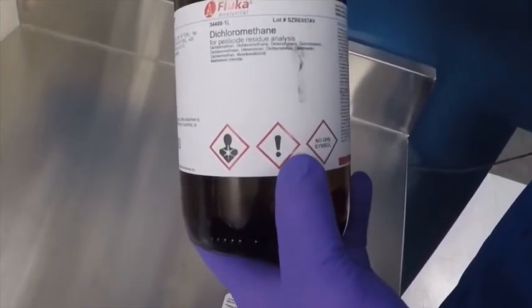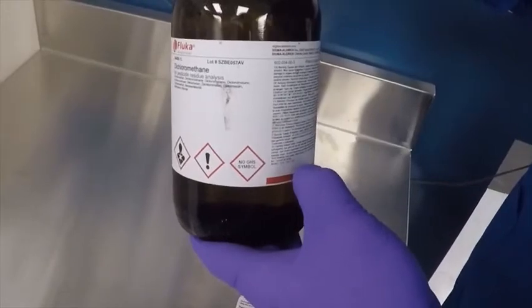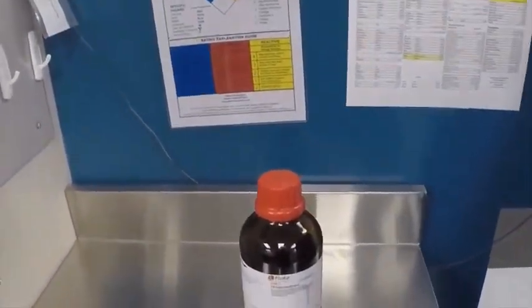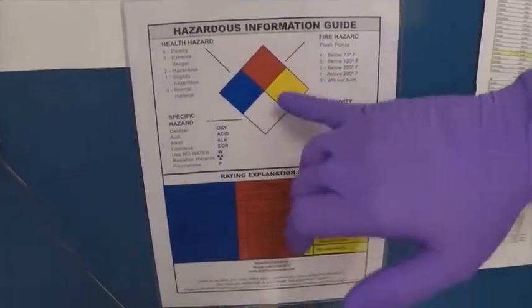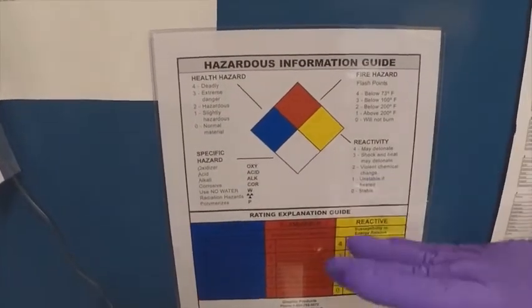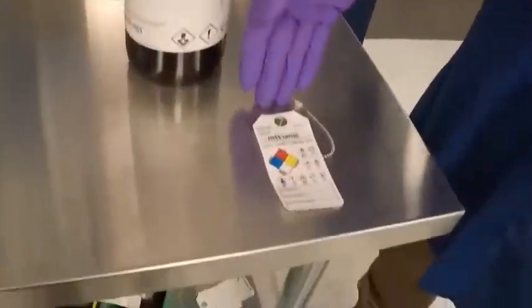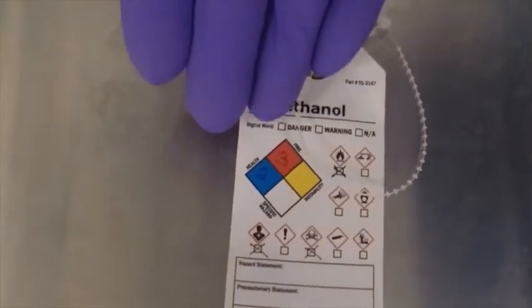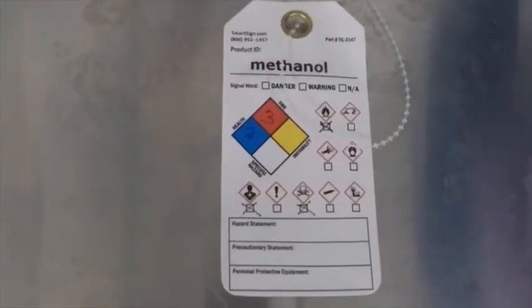There are also colors with these labels. Many labels will also have the NFPA color coding for health, flammability, reactivity, and other. The NFPA ratings are separate from the GHS but can be combined on a single label. For methanol, for example, the health rating is 2, flammability is 3 because it's very flammable, it's a non-reactive material, and it has no other designation. Oxidizers, acids, or bases will have additional designations in the white box depending on the type of material. Please check with your EH&S manager and the safety data sheet for the particular chemical you're working with.